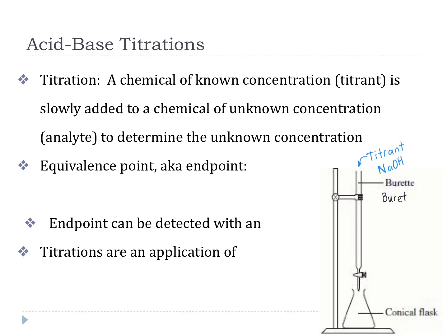Below the burette, you will see an Erlenmeyer flask, and we're going to start with a known volume of our analyte down in there. So we won't be adding any more analyte unless you pass the end point. More about that in a second. Our analyte in our lab is going to be vinegar because we do not know the concentration of vinegar. We are going to be trying to determine that in our reaction.